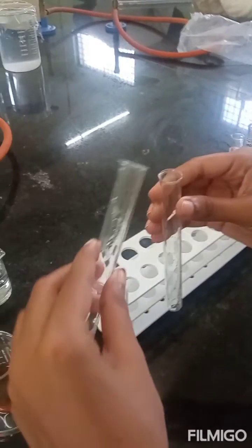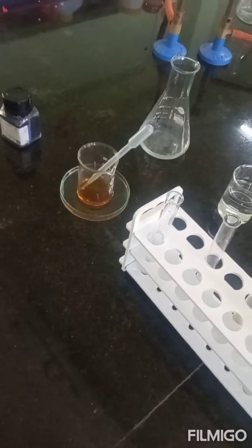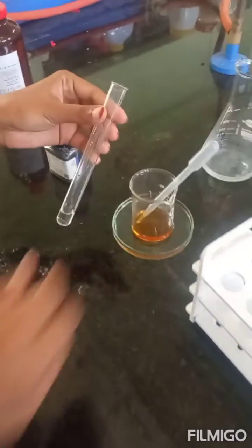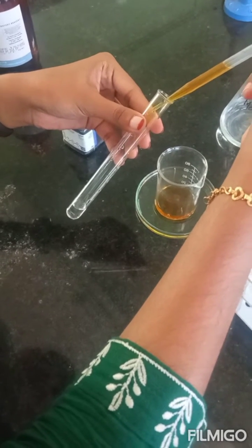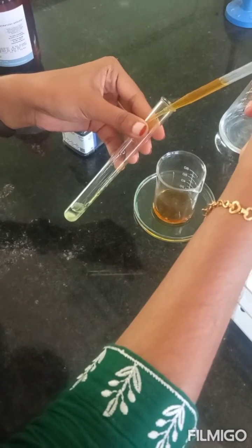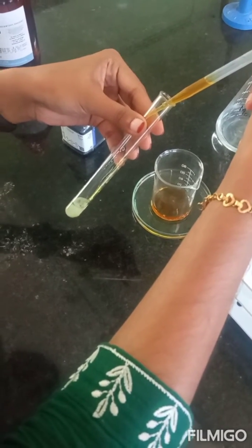Approximately 2 ml of this test solution is taken in a fresh clean test tube. To this 2 ml of glucose solution, approximately 1 ml of Antheron reagent is added. The Antheron reagent is kept in ice-cold water and is added very slowly, so that the Antheron solution and the glucose solution form two distinct layers.